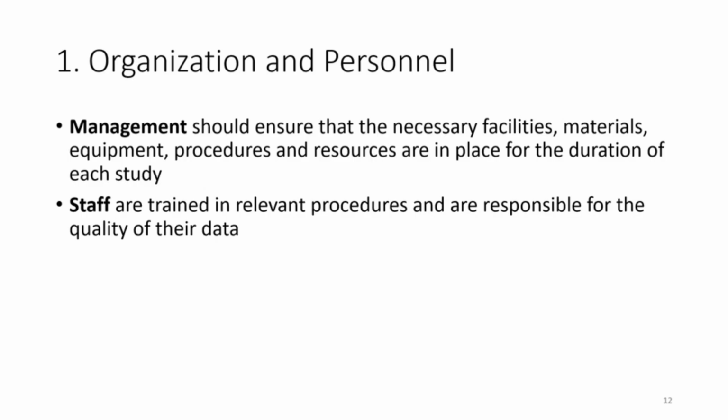On the management side, they should ensure that the necessary facilities, materials, equipment, procedures, and resources are in place for the duration of each study. So in other words, they should have a helicopter overview of the entire study. They should make sure that the resources are sufficient so that the study will not be suspended in the middle of it because of insufficient resources.